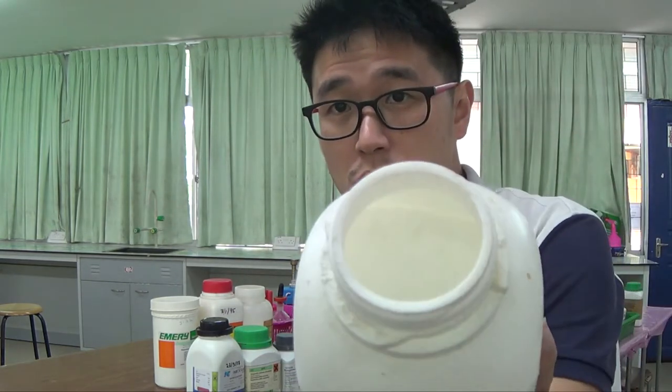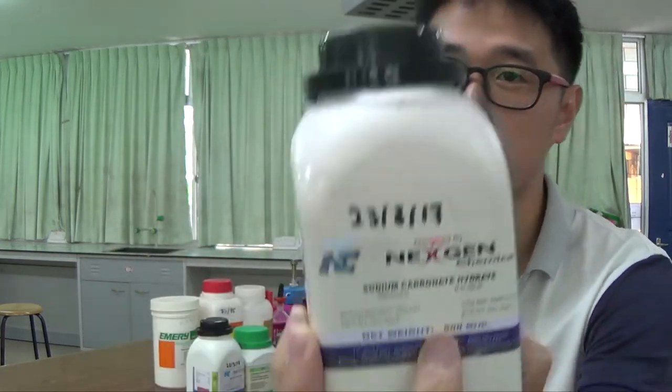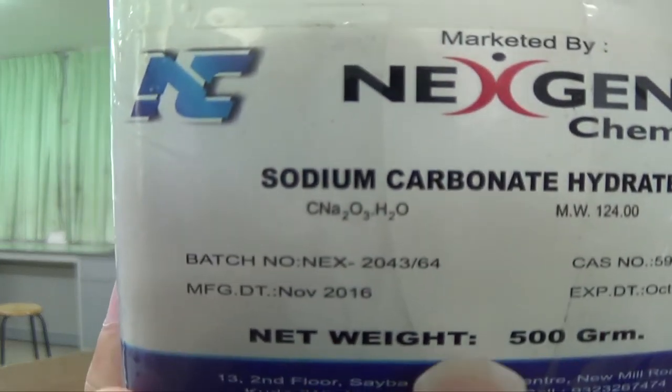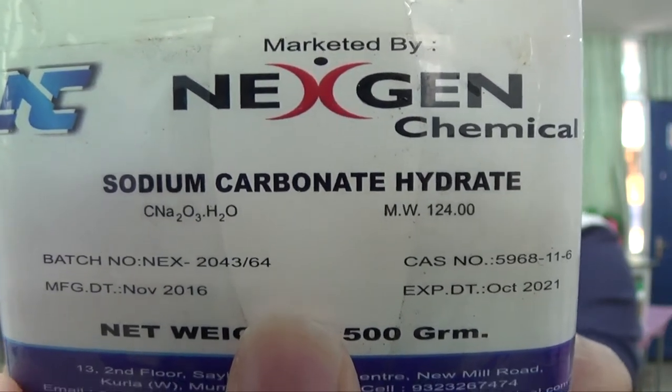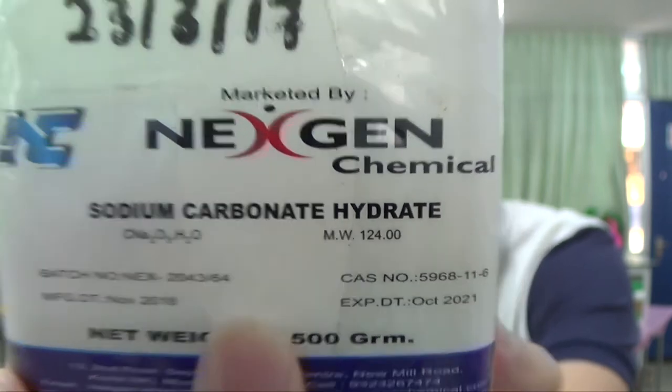Okay, so a bit of white solid there. Sodium carbonate is a white solid. Sodium carbonate hydrated is also a white solid. If you look at the formula very carefully, that thing there is dot H2O, and it's got the molecular weight. Molecular weight refers to the molecular mass, Mr, and it was given to two decimal places.